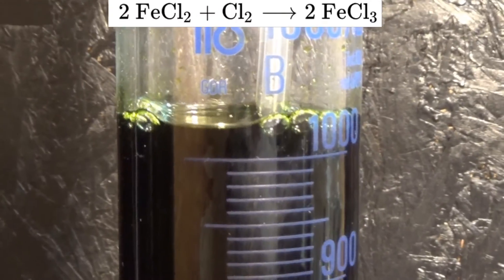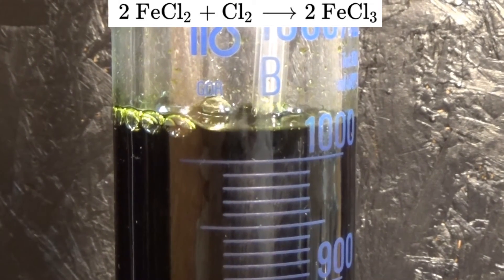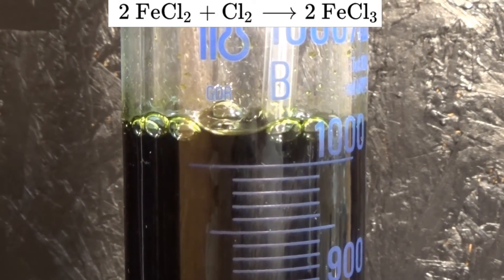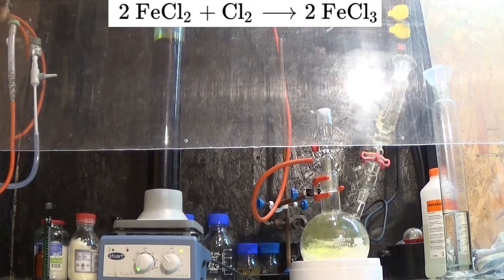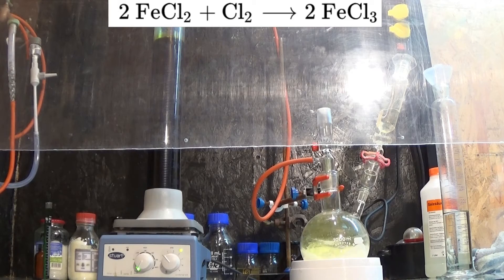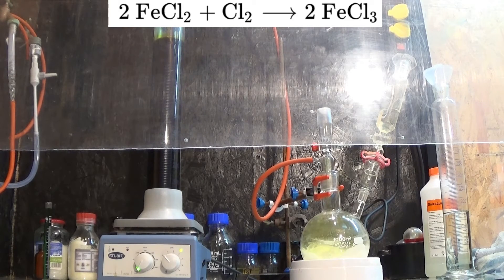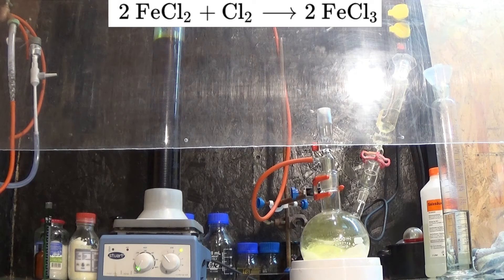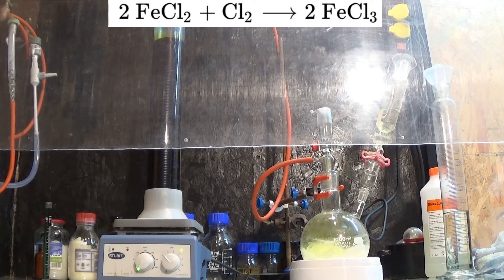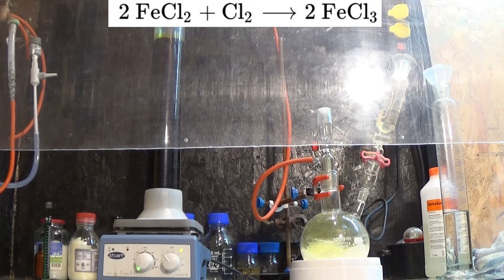Over the course of the reaction, the green solution turns dark and yellow on its sides. This is the clear indicator that the iron 2+ ions are oxidized to iron 3+ ions. The reaction is finished when no more chlorine gas is absorbed. The volume of the mixture increased by around 50 milliliters.